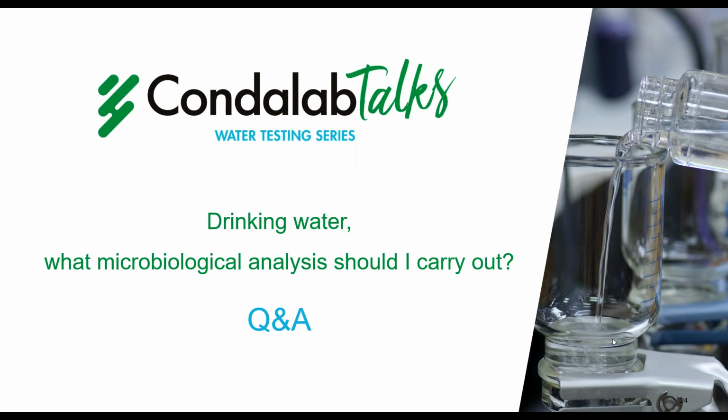I think you're referring to just letting the sample pass with gravity. Of course it is possible. However, I'm sure the bacteria count would be affected by the sedimentation time, or even solids remaining on the surface of the funnel because of the prolonged contact. So our recommendation, of course, is to follow the ISO method and use a vacuum.